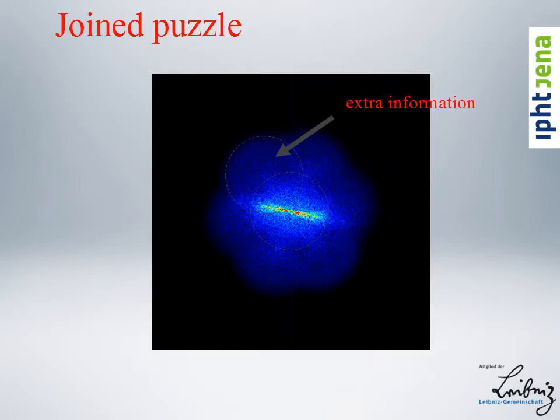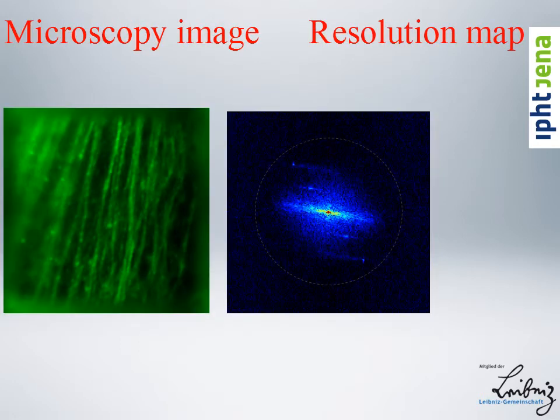So let's look at the real space pictures that we get. This is a single picture taken under structured illumination with this 3-beam illumination, giving you 5 components in Fourier space. This can also be explained by the autocorrelation of the amplitude distribution from the 3 beams, because you're measuring intensity, which is the absolute square of amplitude, which gives you an autocorrelation in Fourier space. So the 3 peaks from the back focal plane become 5 peaks in the Fourier transform of the illumination here. And you see that even in such a single image, these 5 peaks are well visible.